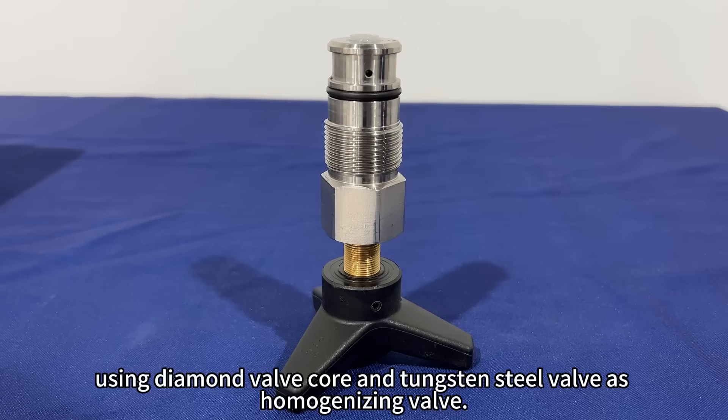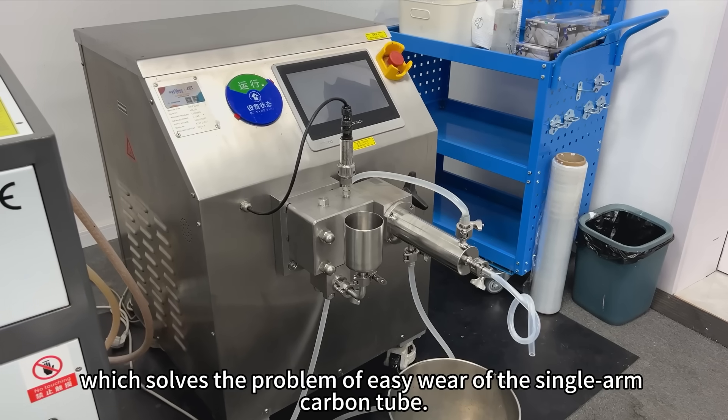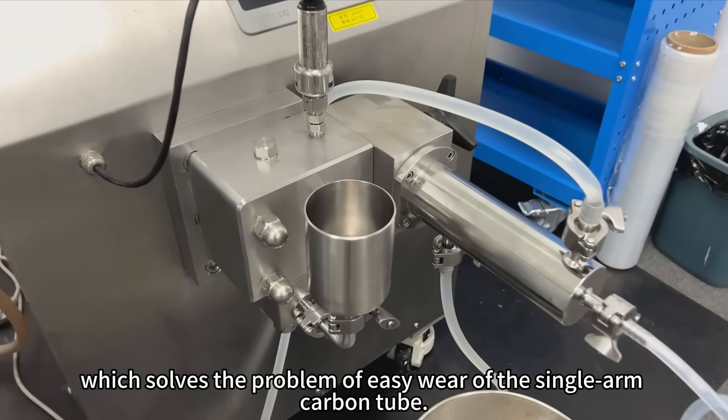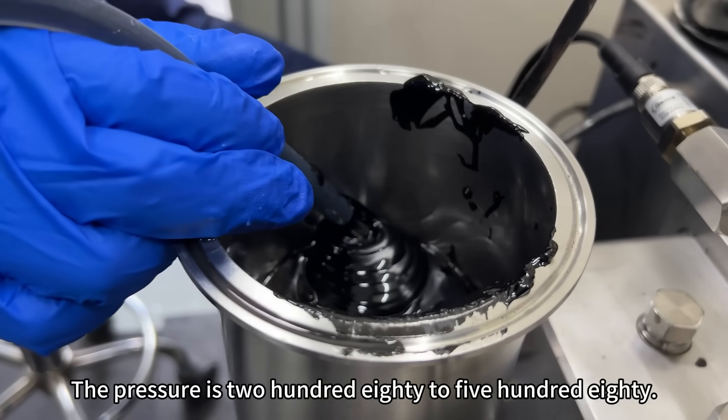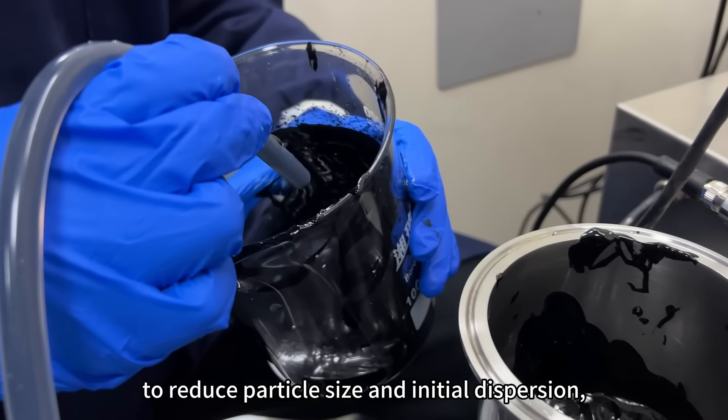We chose an H-pilot using a diamond valve core and tungsten steel valve as the homogenizing valve, which solves the problem of easy wear associated with the single-walled carbon nanotube. The pressure is ramped from 280 to 580 bar to reduce particle size and achieve initial dispersion.